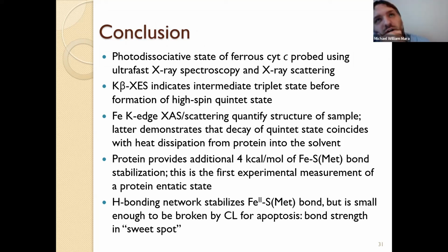That's a great question. Well, it should certainly make experiments faster, right? We have a much faster scan rate, which is ideal. That may be better for picking up on a number of weaker features. One of the things I mentioned was the valence-to-core emission, and you can get a lot of very fine information about the metal center and the bonding from that. However, it's extremely weak, so having much faster sampling could be better in that regard.